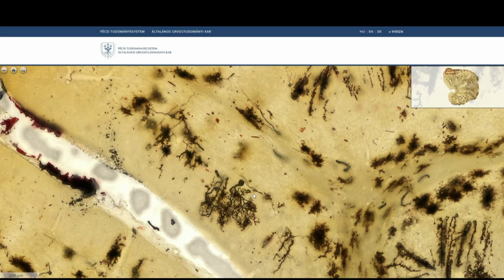In this part of the preparation, you see the Purkinje cell quite well again, and a little bit deeper, under the level of the Purkinje cell layer, we see a quite large perikaryon, but irregular perikaryon. This belongs to a Golgi cell. In the upper part of the slide, here, just above the perikaryon of the Bergman glia cell, so it is already in the molecular layer, you see a basket cell.